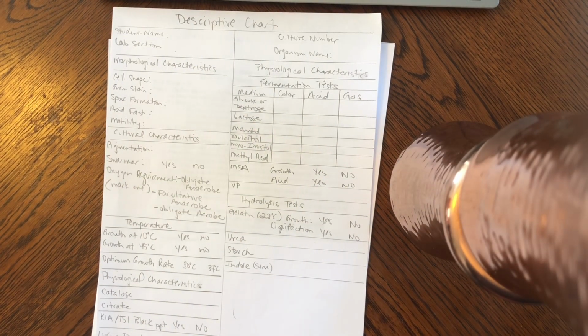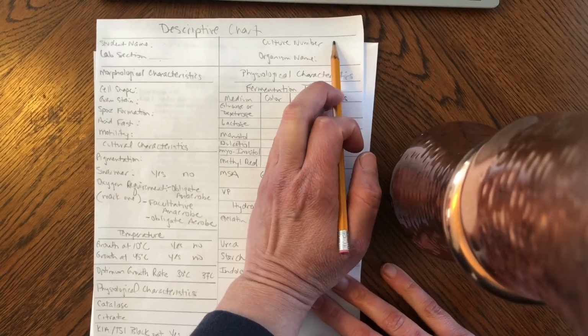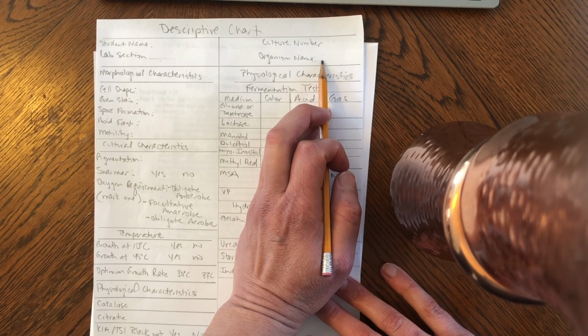In your descriptive chart, you probably already have your name on there, your lab section. The Tuesday, Thursday, 1 to 2:30 lab is section 01. The Tuesday, Thursday, 4 to 5:30 is section 03. And the Wednesday, Friday, 10 to 11:30 is section 02. Not that that's a big deal. If you don't get that right, it doesn't really matter. And then your unknown number will go here. And once you know what your unknown bacteria is, you will handwrite the name out here.